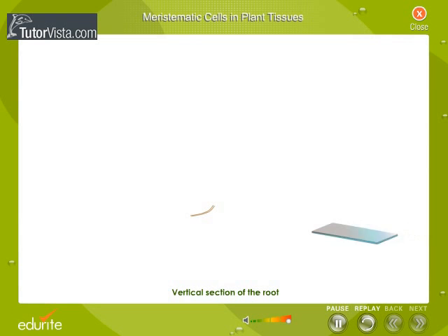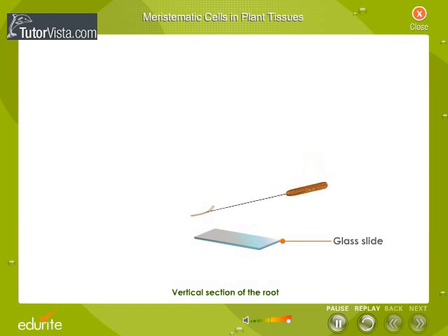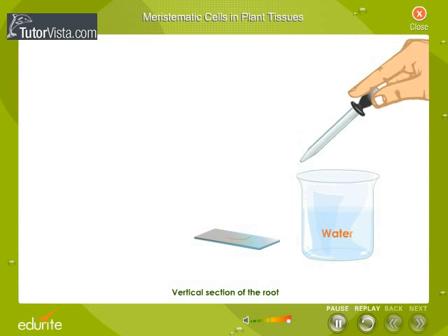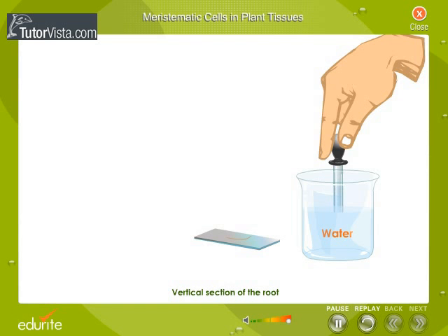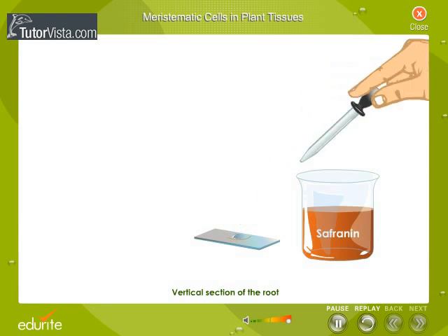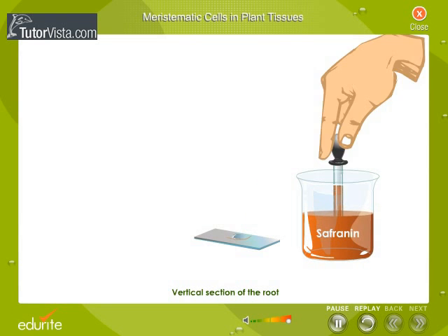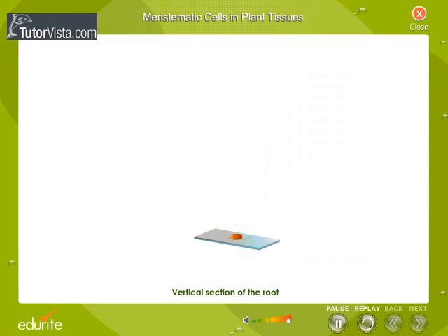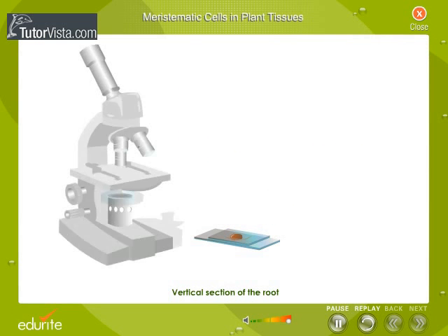Place it on a glass slide on a drop of water, and add a drop of saffranin. Place a cover slip and observe the section of the root tip under a microscope.